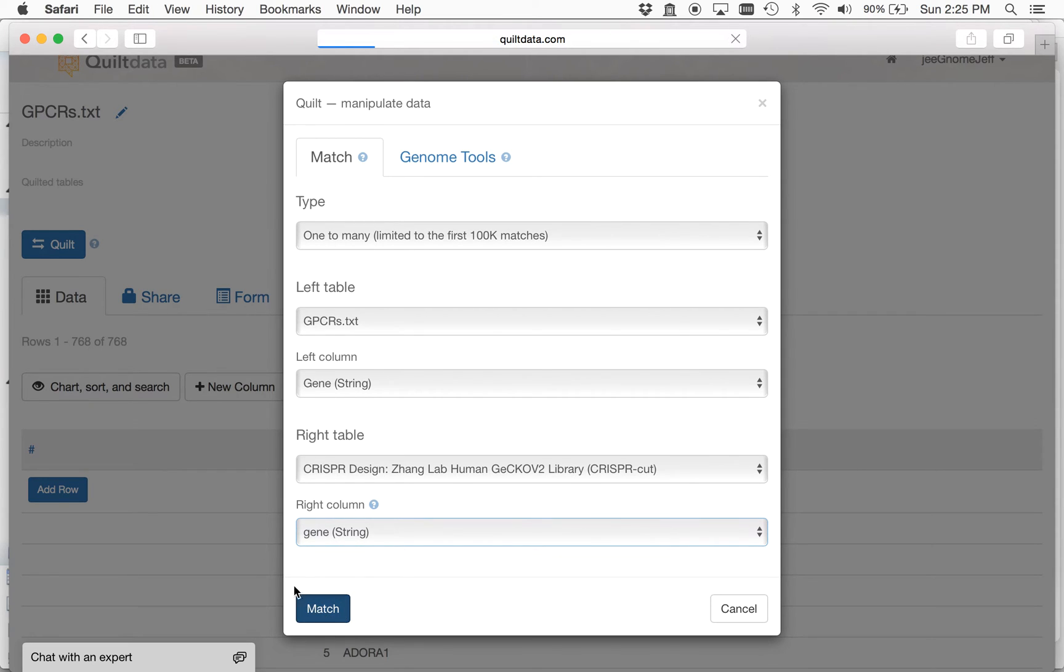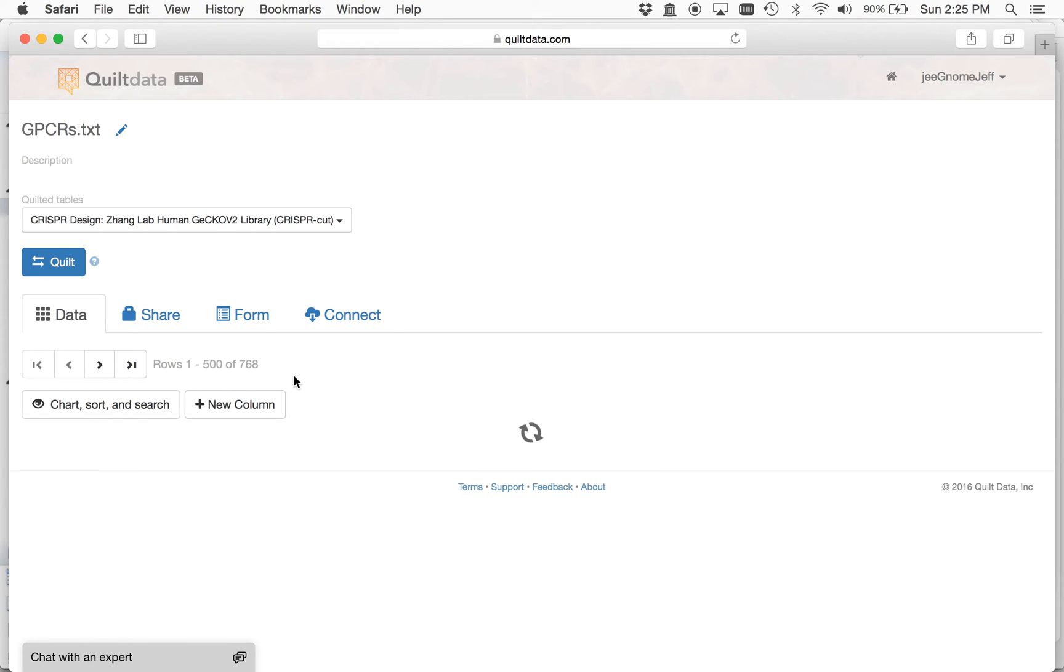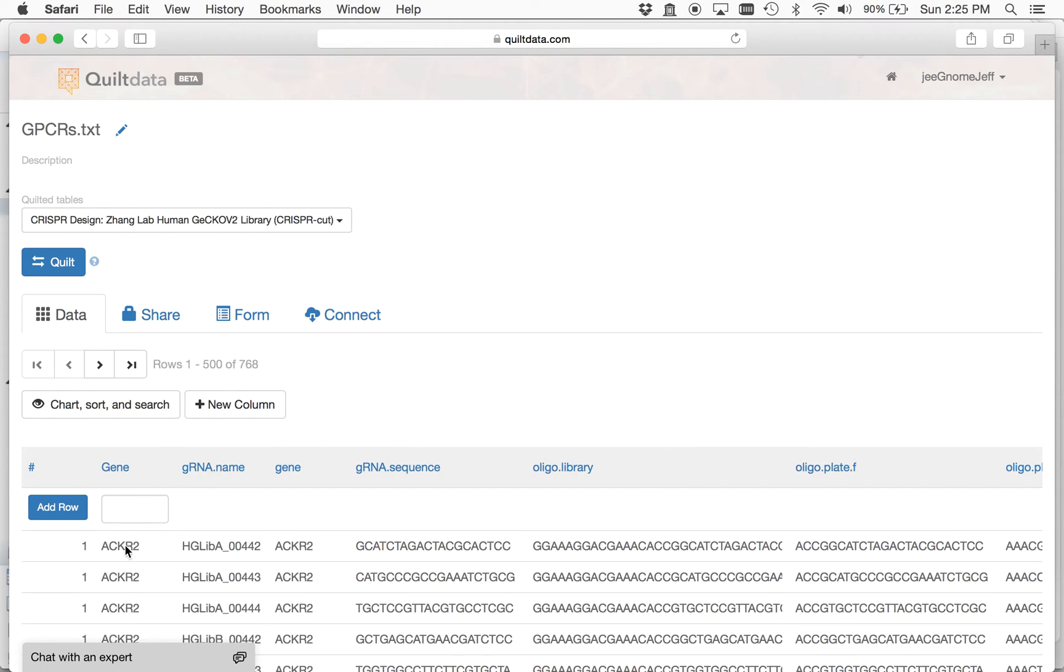And what will happen is that these genes will start to get matched up with designed guide RNAs, and what you're going to see is for each gene you'll have a guide RNA, and you'll have a number of them. This is why it's one-to-many.